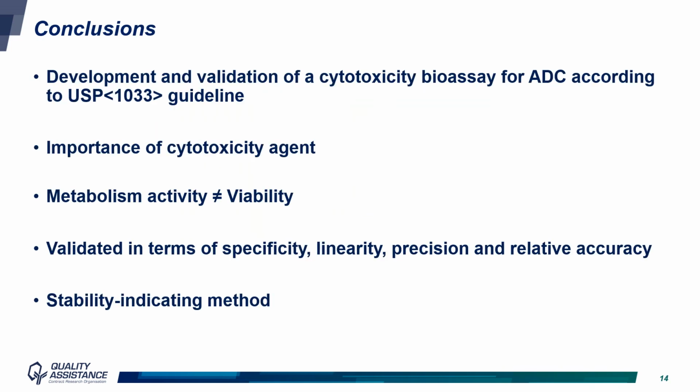In conclusion, this study demonstrates the successful development and validation of a cytotoxicity bioassay using Kadcyla as a model of antibody-drug conjugate. This study also highlights the importance of the revelator agent choice. Indeed, agents measuring the metabolic activity of the cells are not always the best choice depending on the cell culture conditions. It is therefore more appropriate to use agents that directly measure the cytotoxicity based on exclusion dyes, DNA intercalating agents, or change of the mitochondrial membrane potential.